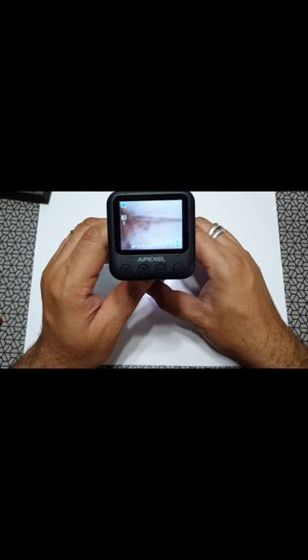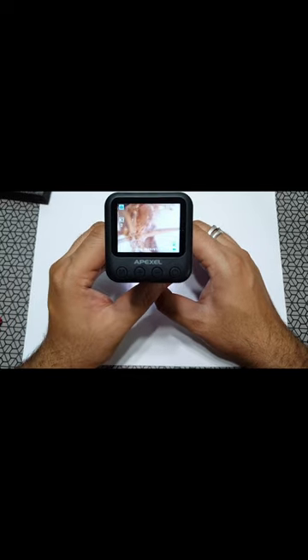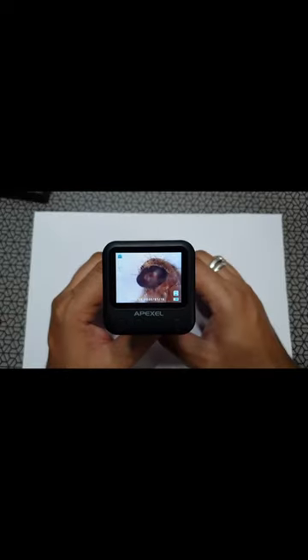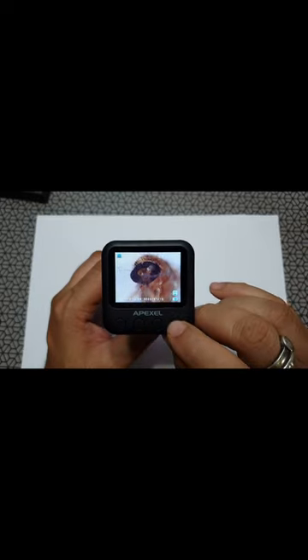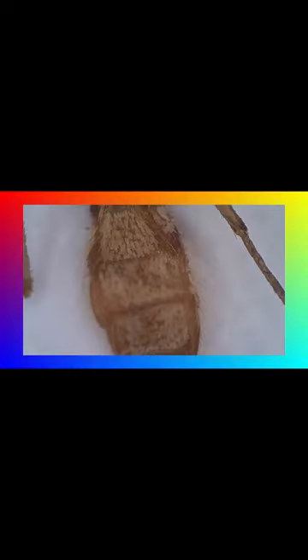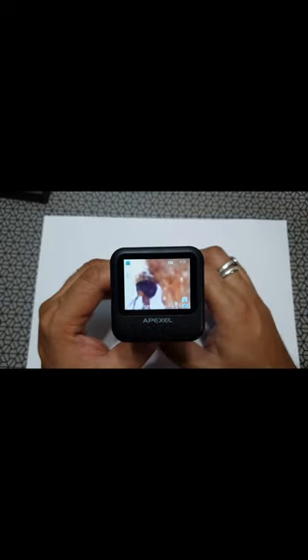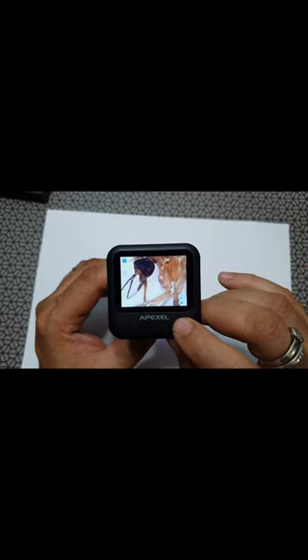Speaking of subjects, this is a small little mosquito — let's see how good it looks. I'm doing this handheld, so just bear with me while I get it in focus. There's a small focus ring at the bottom, and you can see it's pretty clear. I'm using just an A4 white sheet as the background. This is the image you get on the microSD card — not very clear, but still very much usable. And that's really, really clear. This mosquito seems quite dangerous when you actually look at it up close in this little microscope.